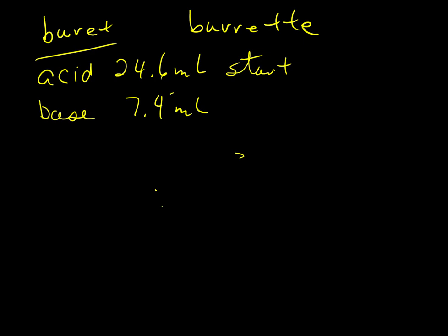So now I need my final numbers. My acid ended up at 35.9, and my base ended up at 35.3.